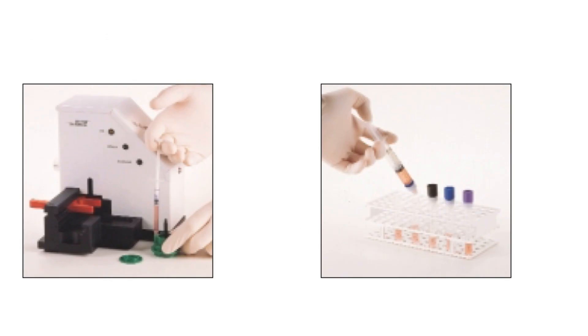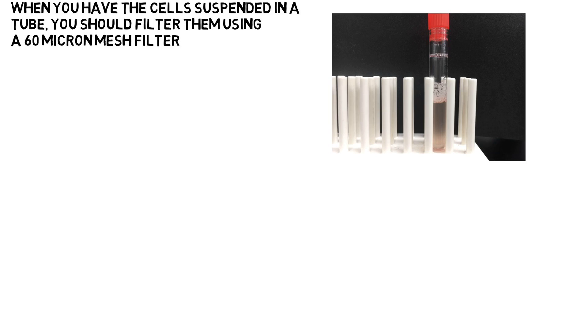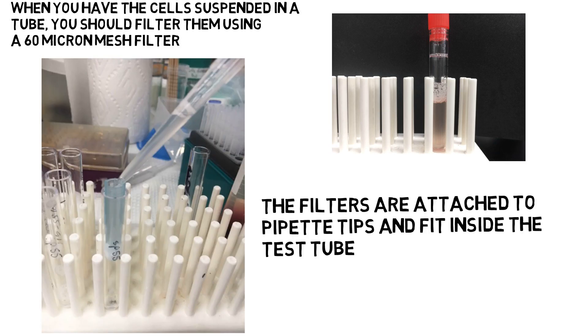It may be necessary to rinse the Medicon out with 1 or 2 ml of saline. We normally pass the suspended cells through a 60 micron mesh filter that we place into a test tube as shown here. This removes large clumps that might have passed through the Medicon.